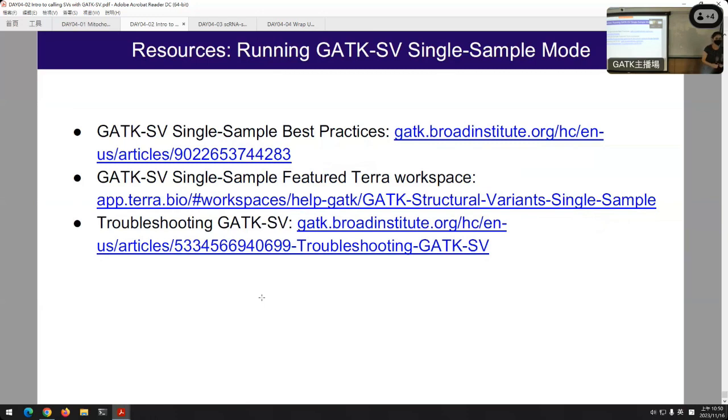I have a question about that VCF example. You mentioned that there are 5 algorithms used in the GATK-SV pipeline, but why does it just show Manta as the algorithm? Yeah, so in the VCF, you can actually see which algorithm originally discovered that variant in that sample. And so for the example that we were showing, Manta was the one that found that variant.